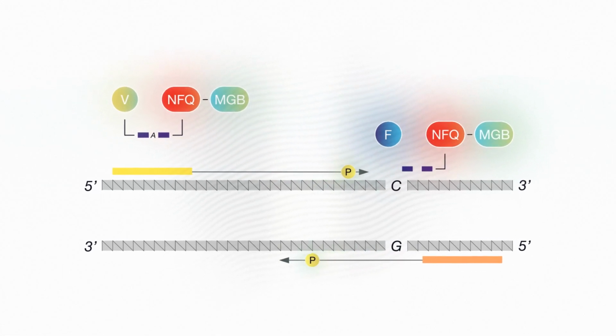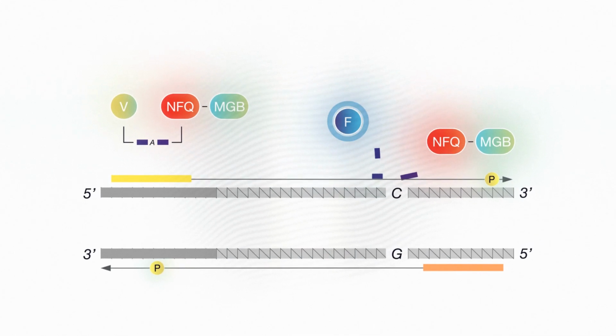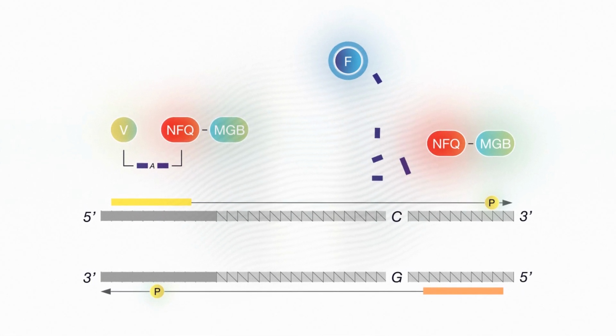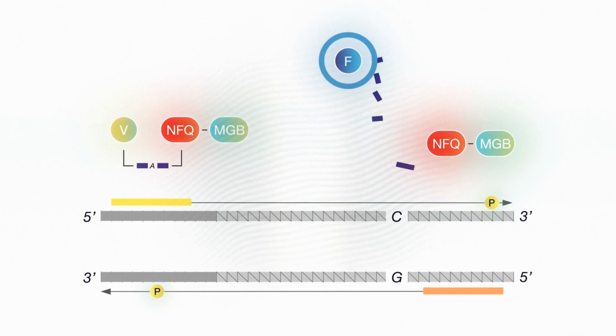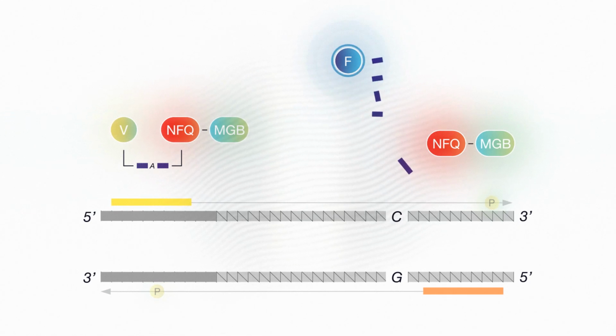During polymerization, the DNA polymerase only cleaves probes that hybridize to a target sequence. Cleavage separates the reporter dye from the probe. The separation of the reporter dye from the quencher dye results in increased fluorescence. The increase in fluorescence occurs only if the target sequence is complementary to the probe and amplified during PCR. Because of this, nonspecific amplification is not detected, and the fluorescent signal clearly indicates which alleles are in your sample.